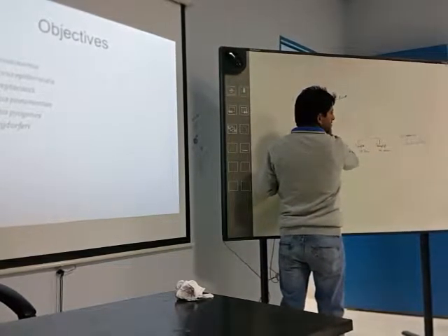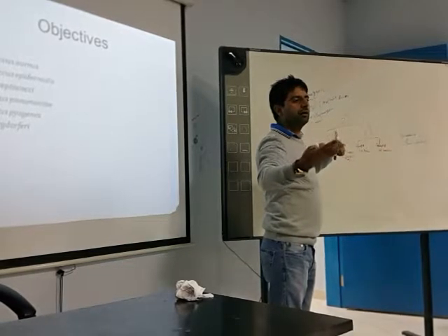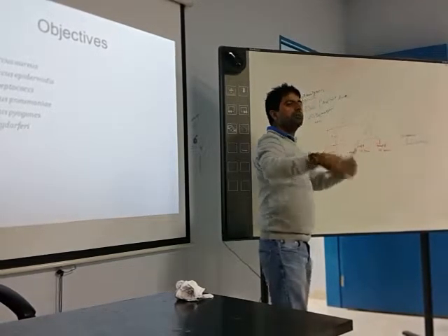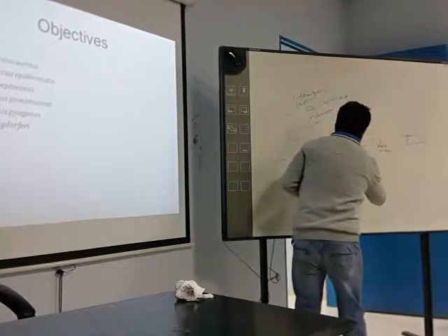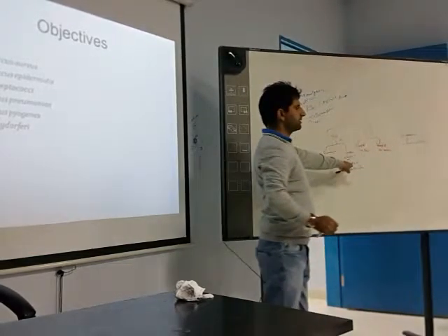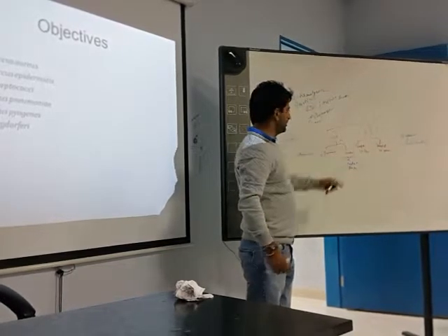This is the reason it's called viridans, because of alpha hemolysis and formation of the green color. In the viridans, a number of microorganisms come, like mitis, I give one example, mutans is one more example. A number of bacteria come under this class. And one more alpha hemolytic is Streptococci pneumoniae.